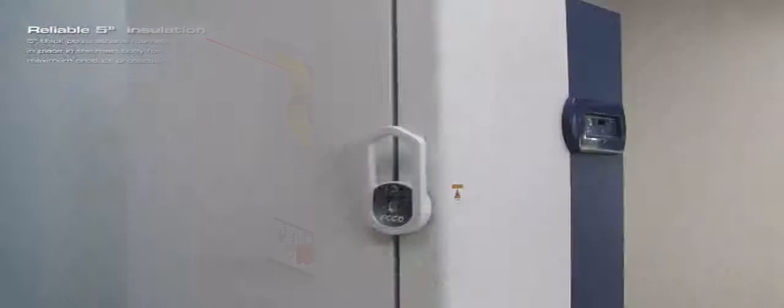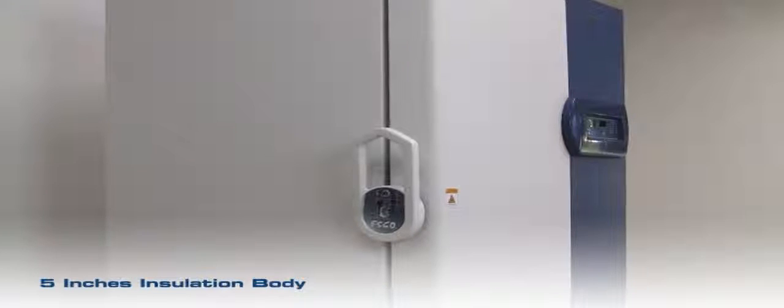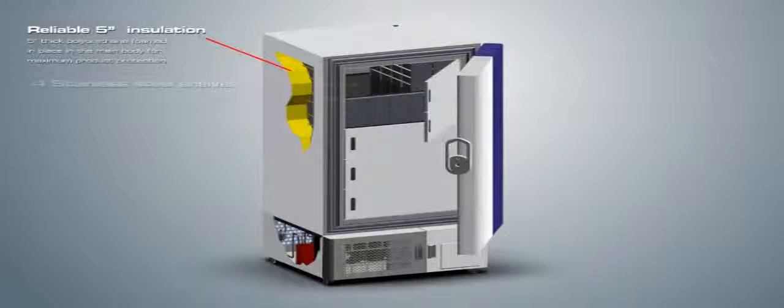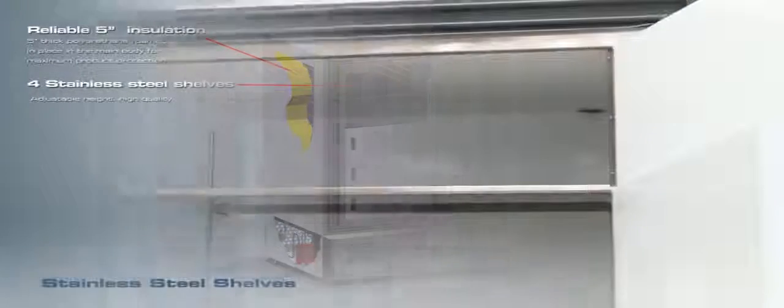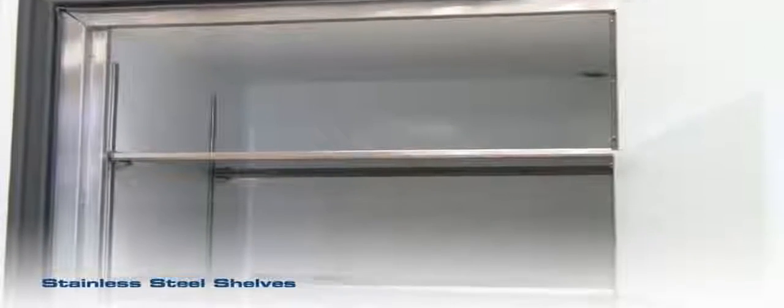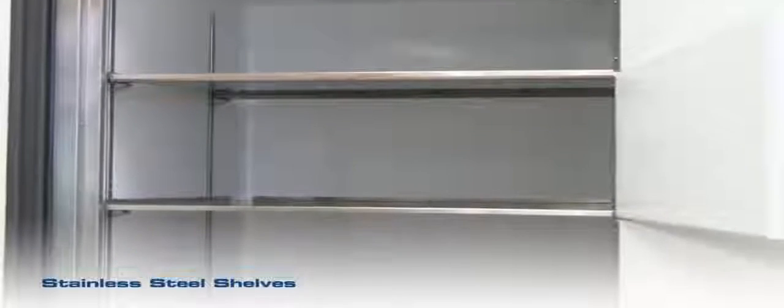A 127mm 5-inch thick polyurethane foam is placed in the main body to insulate the chamber for maximum efficiency by minimizing temperature loss. High-quality stainless steel shelves with adjustable height are provided with the unit.